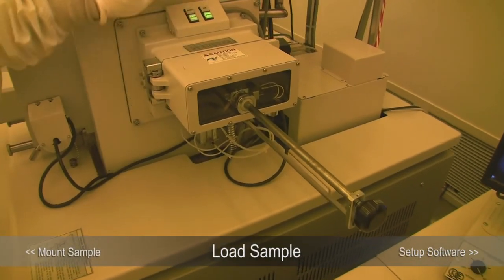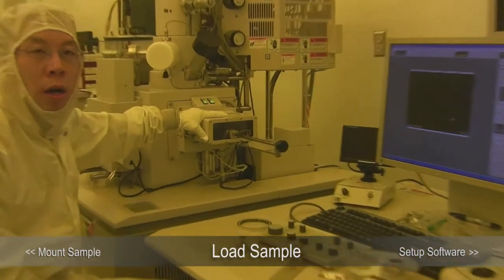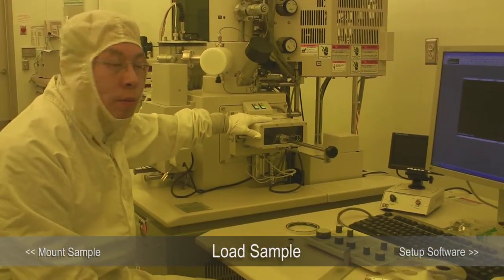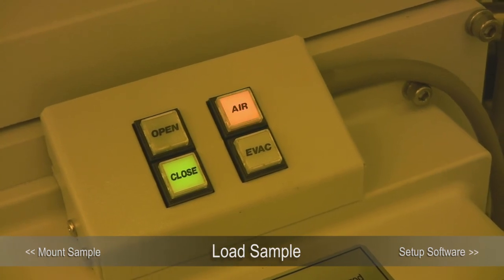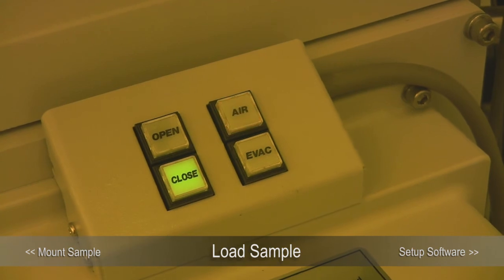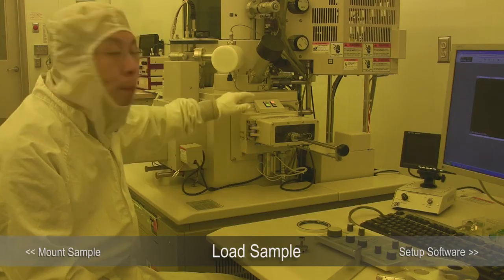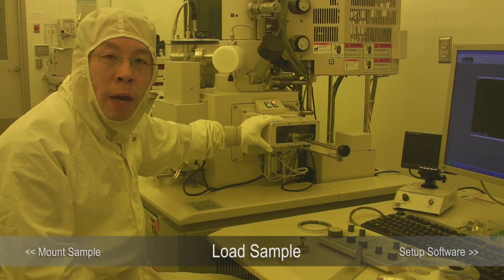To load the sample, we press the air button. That vents the load lock to atmospheric pressure. The air button will continue to flash until it reaches atmospheric pressure, then it will stop flashing and you will hear a beep sound. That beep sound indicates the load lock is now at atmospheric pressure.